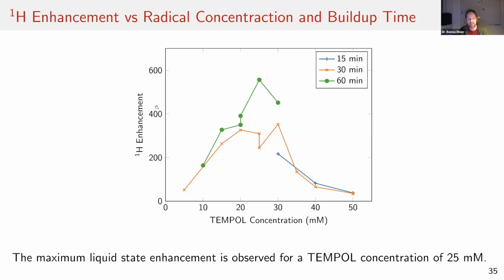Actually, these enhancement values here, you can still boost. This is again with protonated glycerol. If you go to deuterated glycerol, then at least for this molecule here, which is acetate, we get something like 3-fold higher enhancement. So maybe now we can routinely get 2000-fold enhancement. Then indeed, we wouldn't need to go via carbon. But of course, this would only hold true if we can record all the information that we want very quickly, because if we don't have carbon anymore, then we can't retain the polarization for a very long time.